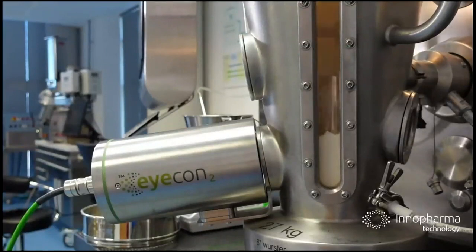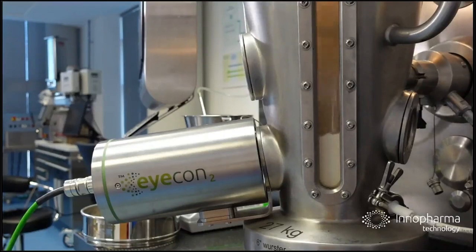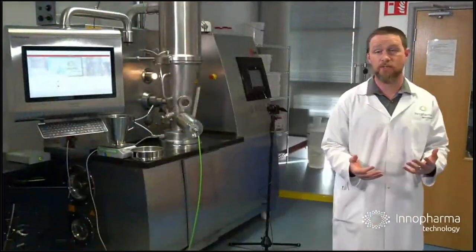You can see from the long operator window that the material's fluidized, so it's constantly passing by the window. So we're getting data every couple of seconds on what's happening here. So if we change something like airflow, liquid addition rate, air temperature, we could measure that in real time, what's happening. At the back here, we can see the green communication cable, and that will run over to your process area where you'll have maybe an industrial PC or something like a laptop to read that.